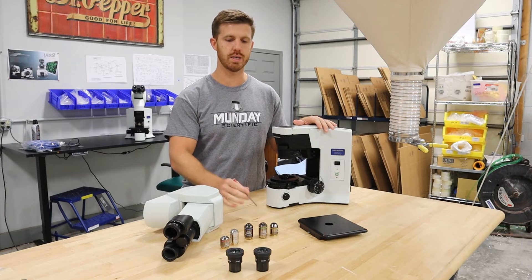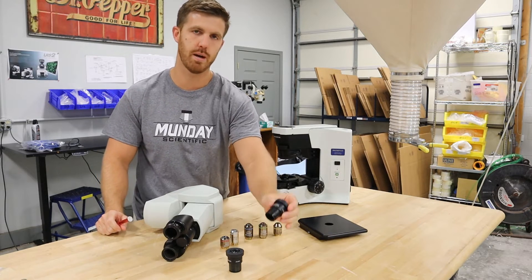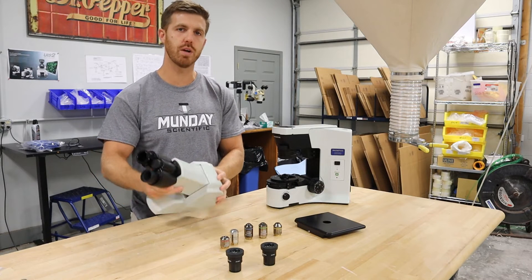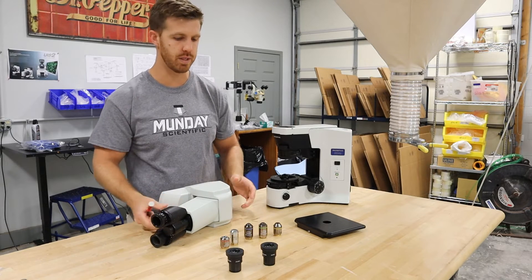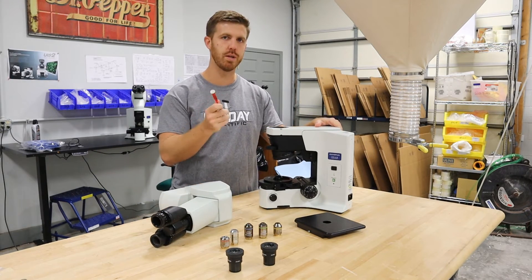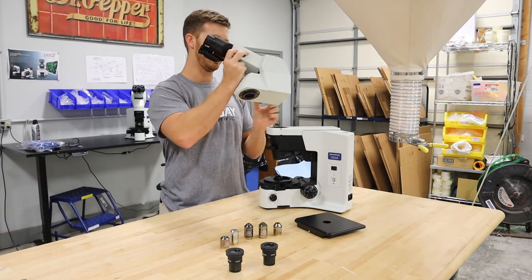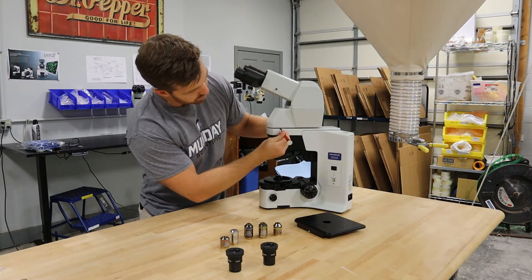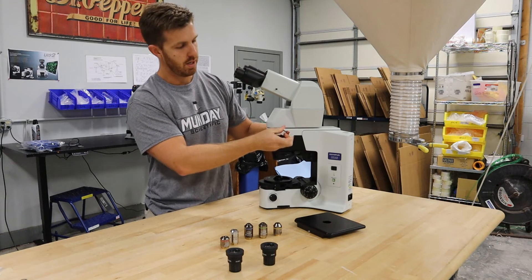Once you unbox everything, it's going to look like this. You're going to have your objectives in little bubble bags, eyepieces in little bubble bags, your stage, and your head. You may have a couple of different versions of this head. So the first thing I would do is take the microscope, your three millimeter wrench, and put the head on. It's got a dovetail flange — make sure it lines up.